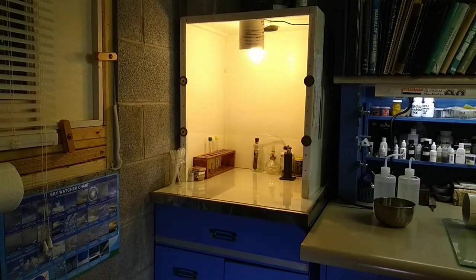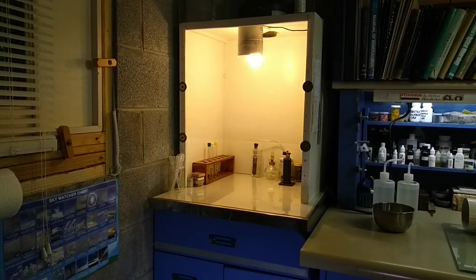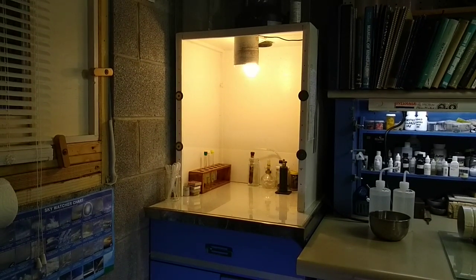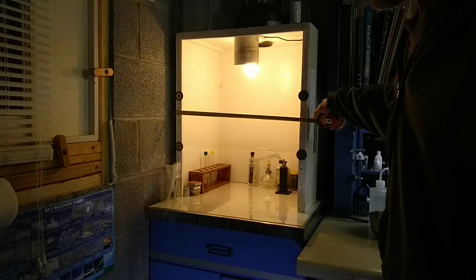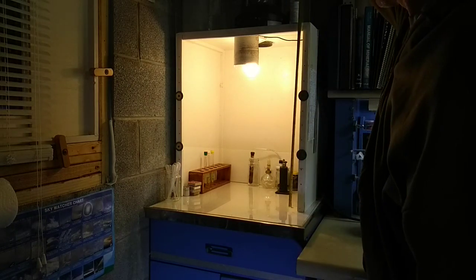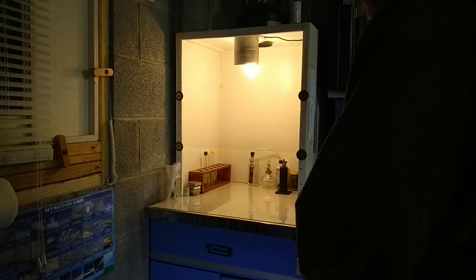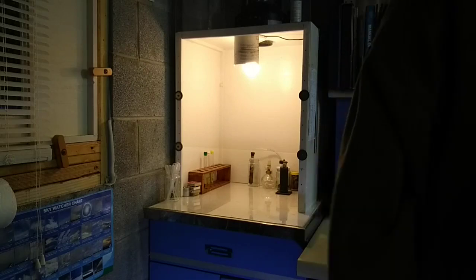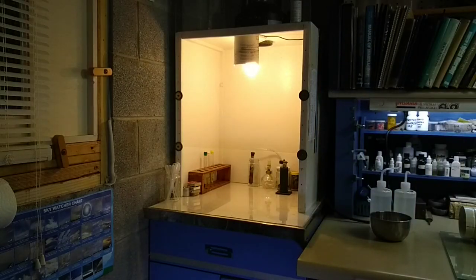Alright, on top of the cabinet is the fume hood itself. And boy, that's nice to have. I made that myself, and it's basically a wooden box. There's nothing at all special to it. If you want the dimensions, it's about 22 inches by about 26 by about 16 inches deep. There's nothing magical. I just made it to fit on top of the cabinet.